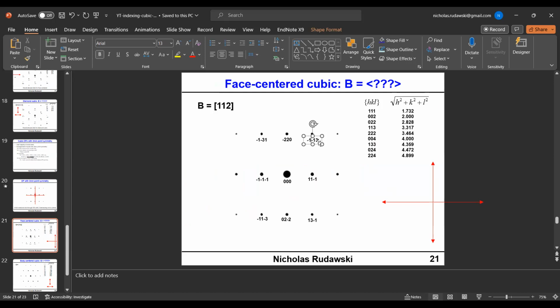So this is 1 bar, 3, 1 bar. Okay. And then you can do the rest of these spots yourself as well. I'll just do a couple more here. Oh, what the heck? I'll do them all here. Not that many of them.